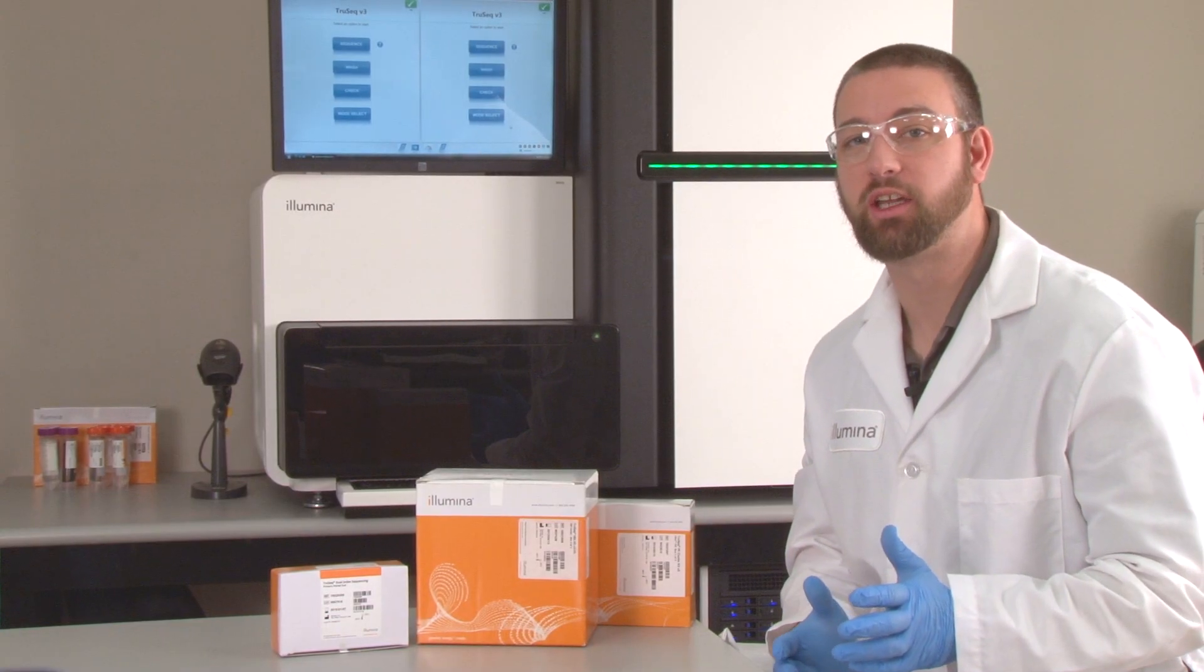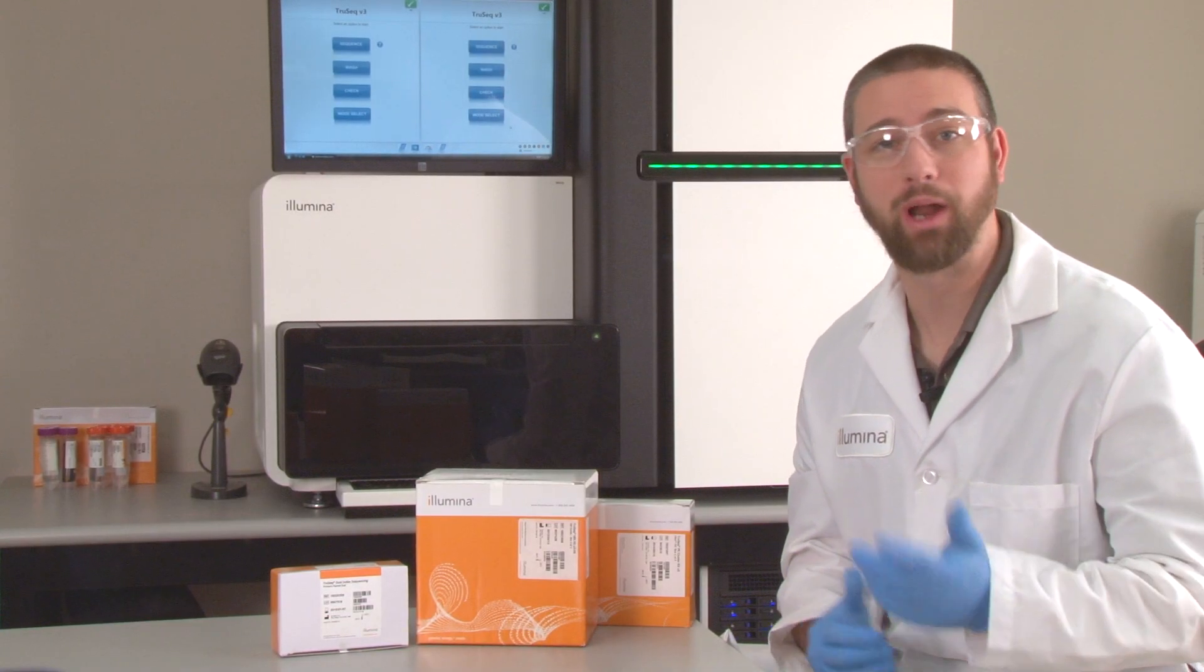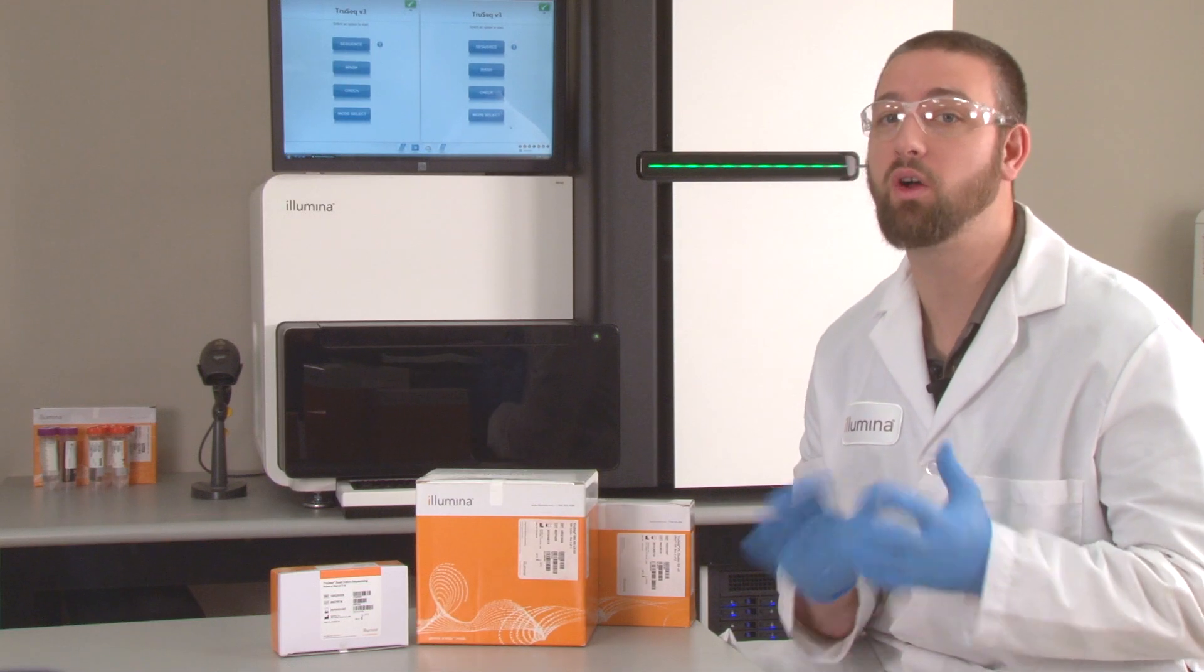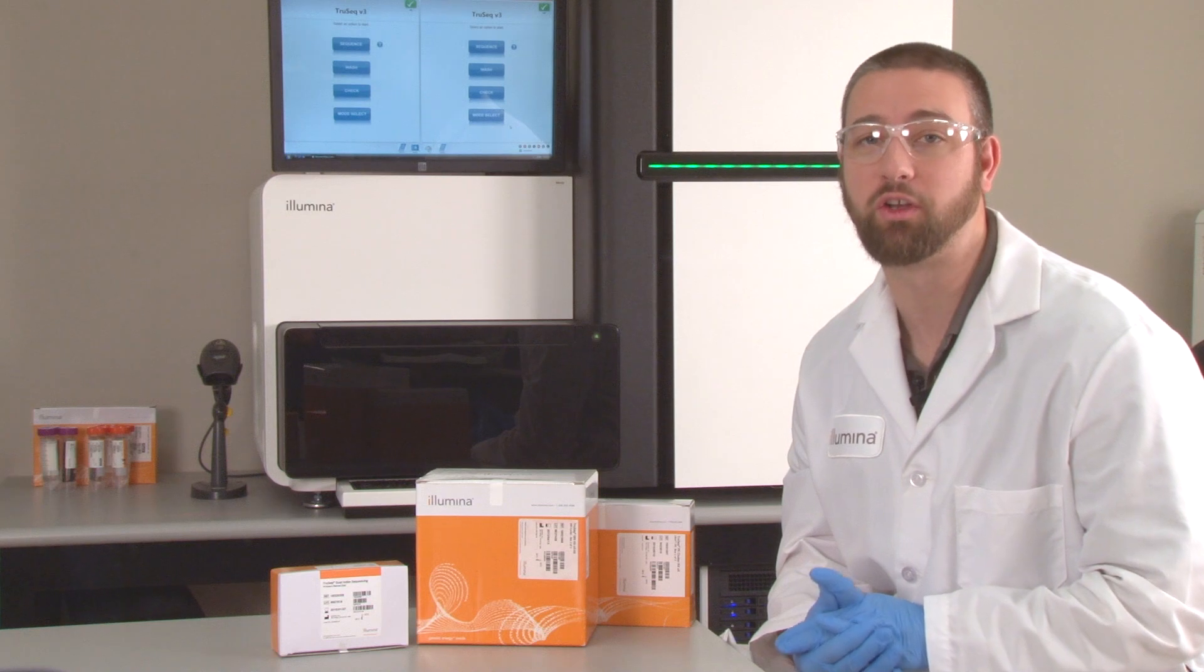All cluster generation kits from HiSeq version 4 and Rapid Run version 2 and later have the compatible versions of sequencing primers for all standard Illumina library preps included in the kit. No additional reagents are necessary.